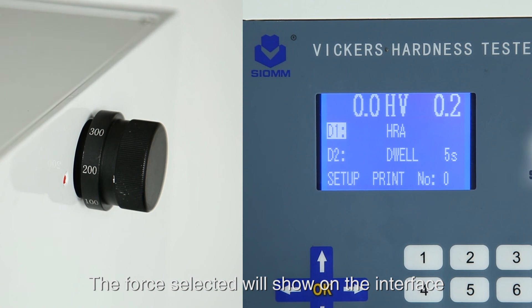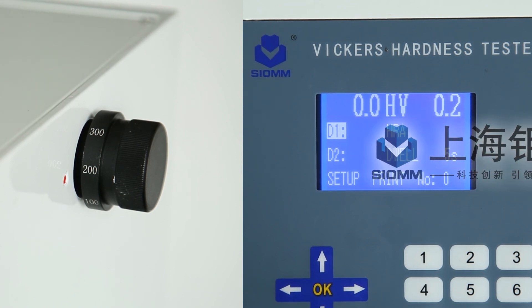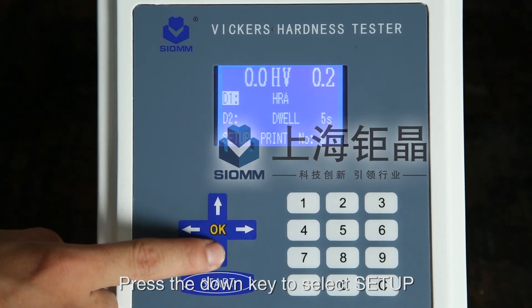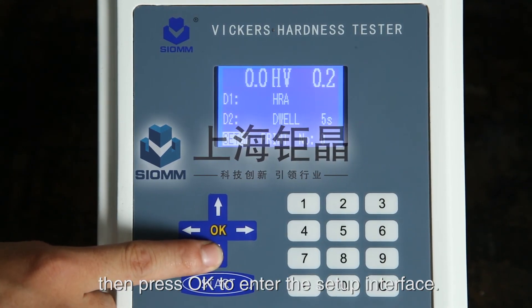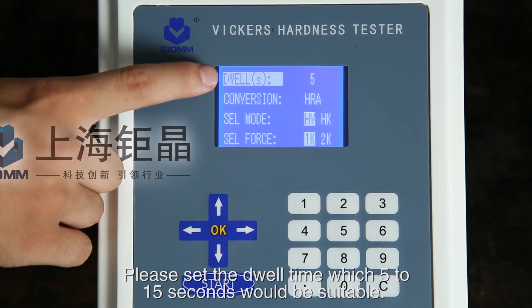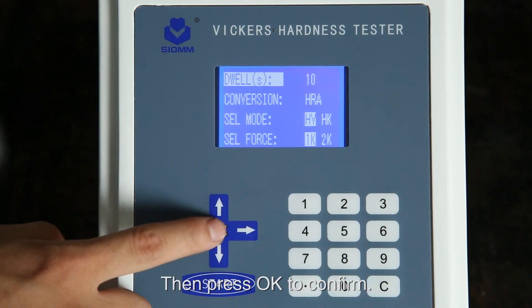The selected force will be displayed on the interface. Press the down key to select Setup, then press OK to enter the setup interface. Please set the dwell time — 5 to 15 seconds is suitable — then press OK to confirm.